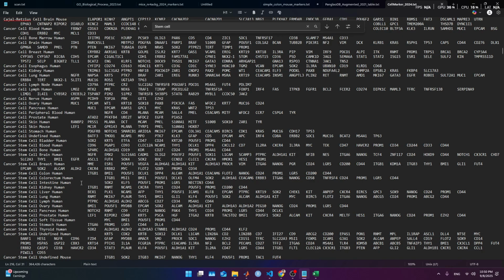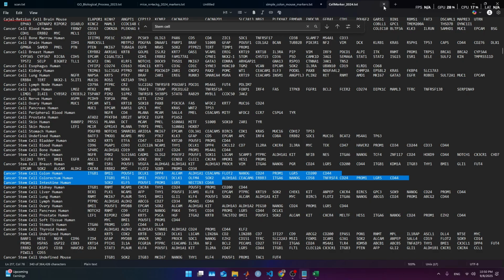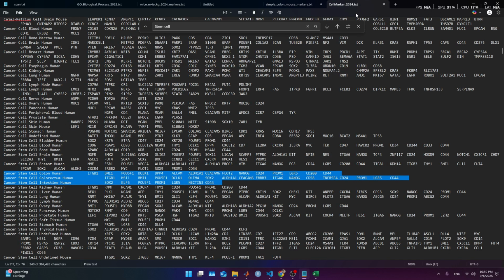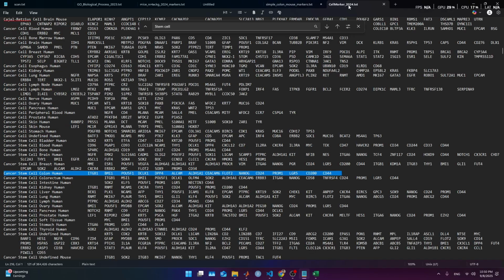I'm gonna bring those ones to my... sorry for that, for this guy. So we're gonna keep it here and let's fish for some other stem cell, breast, colon, human. Here's more. We have even more. Copy and paste. Colon, cancer stem cell. Okay, we can consider that.